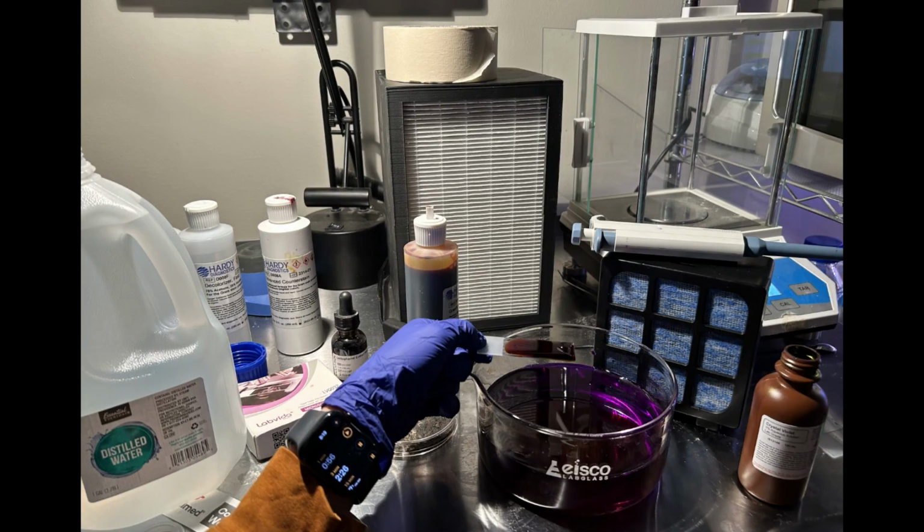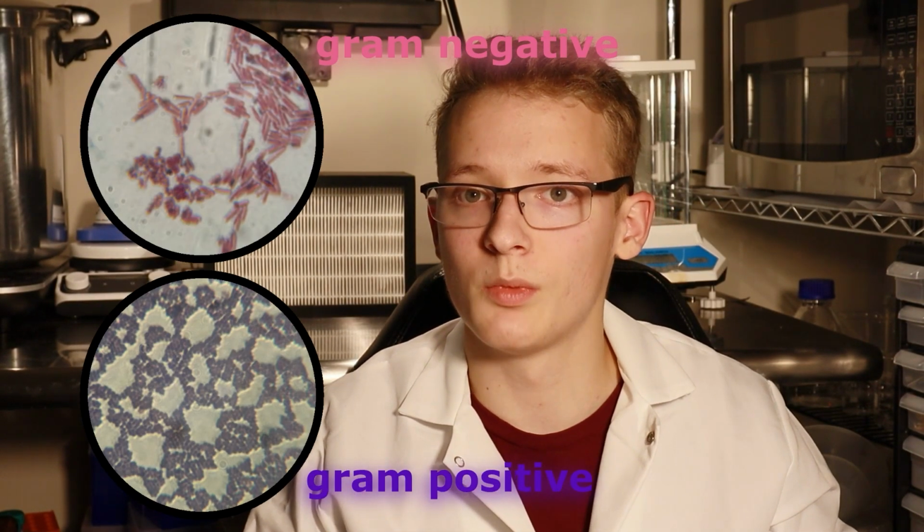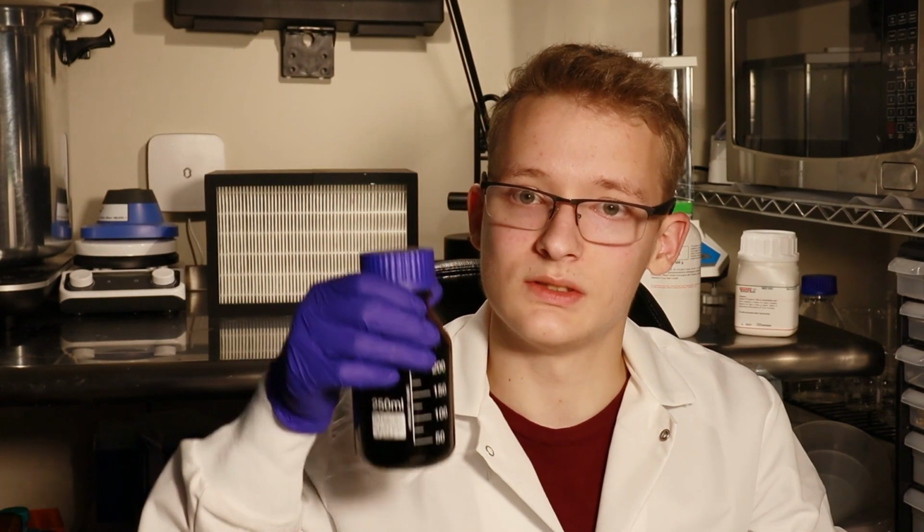Now each day of the project, I planned for several things to be done to each plate. The first thing being a gram stain. This would determine whether the bacteria I grew was gram-positive or gram-negative, which is basically a type of cell membrane bacterial cells have. A gram stain traps a purple dye called crystal violet inside of gram-positive bacteria, but fails to do so to gram-negative bacteria. This allows us to see the bacteria's shape and what type of cell membrane they have, which tells us a lot about whether or not we are looking at the right bacteria.